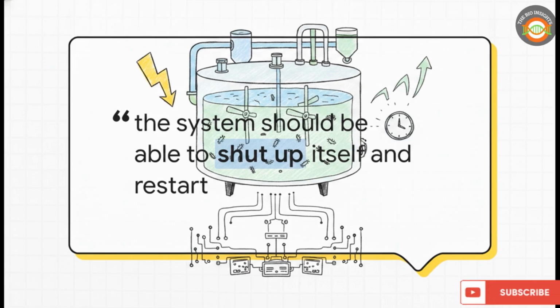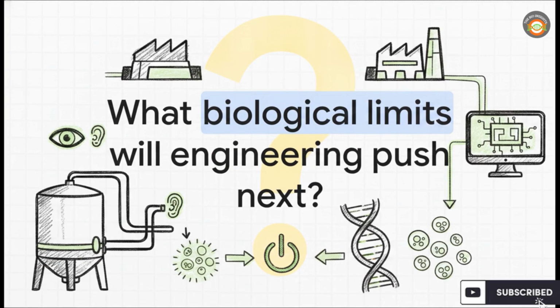It's just incredible. And that brings us to a final thought to leave you with today. We've seen how probes and sensors act as the eyes and ears of the fermenter, and how the computer acts as the brain. If advanced code and sterilizable hardware can effectively pause and successfully resurrect millions of living, breathing organisms after a total blackout, what other biological limits will computer-controlled engineering push past next?